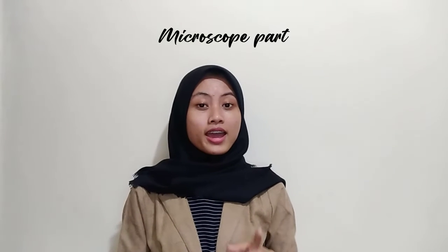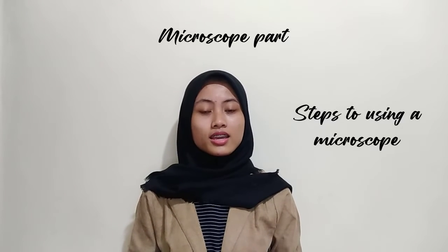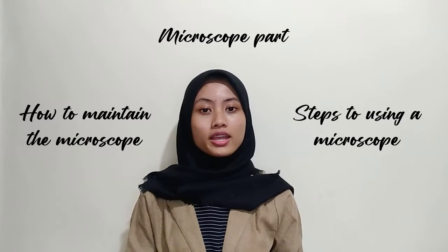To use a microscope, we must know the function of each part of the microscope, and knowledge is needed about how to use a microscope properly and correctly. It is also necessary to properly care for the microscope, so that it can be durable and long-lasting in use, and so that when making observations there are no disturbances found in the microscope, such as fungus, dust, and oil below the microscope lens and other disturbances in the non-optical part of the microscope if not treated.